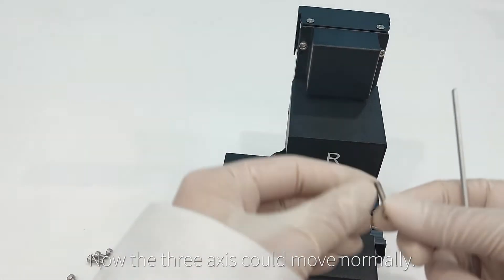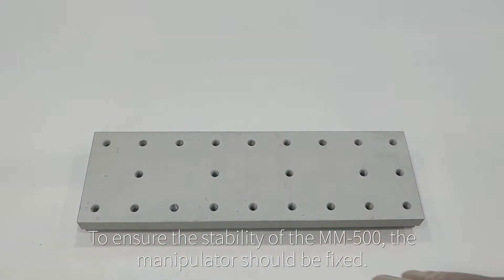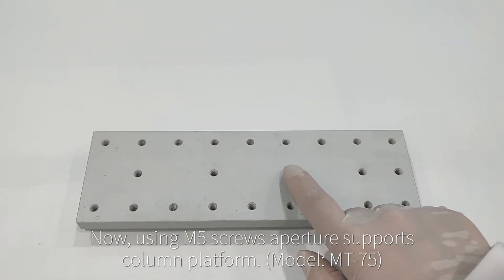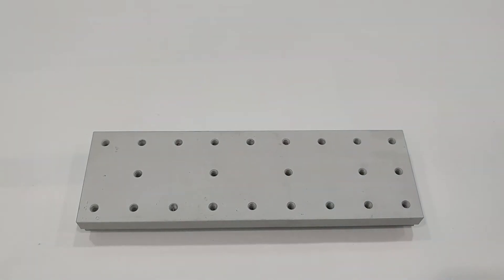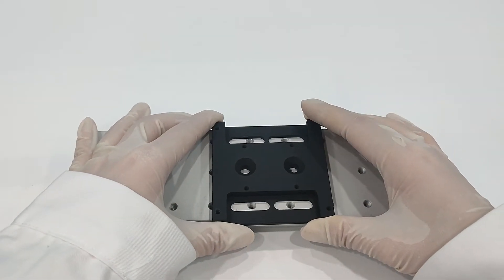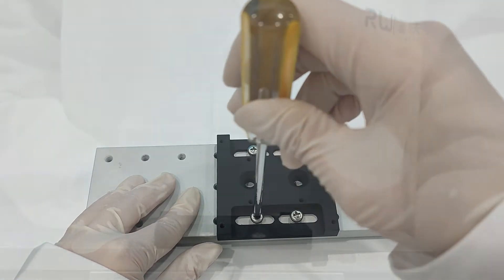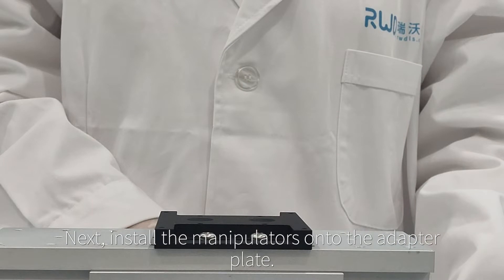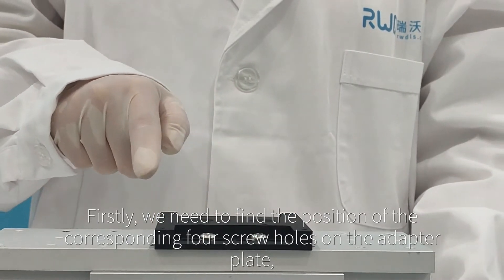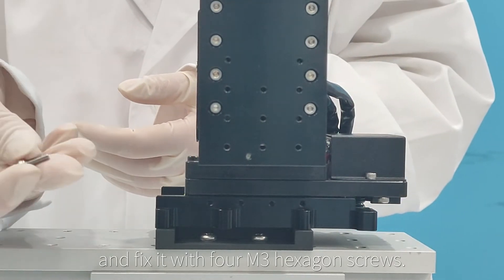To ensure stability of the MM-500, the manipulator should be fixed. We can choose a platform with holes of M5 or M6 screw aperture for fixing. Place the adapter plate in the appropriate position on the platform and secure it with four cross screws. Next, install the manipulator onto the adapter plate by aligning the four screw holes and fixing it with four hexagon screws.